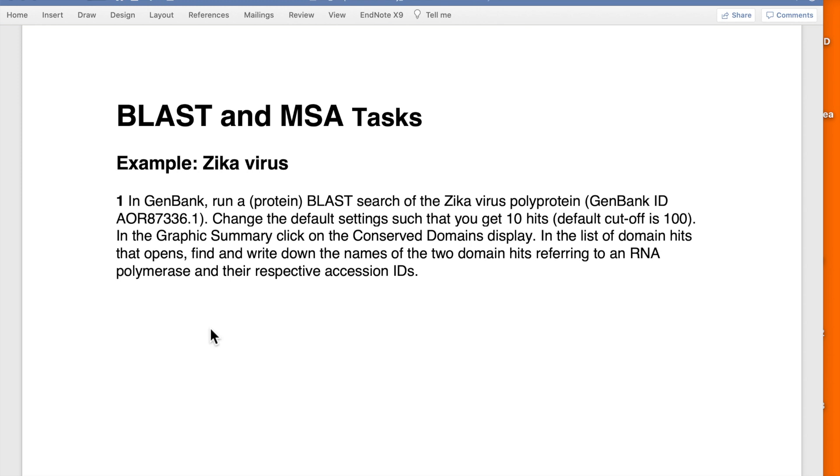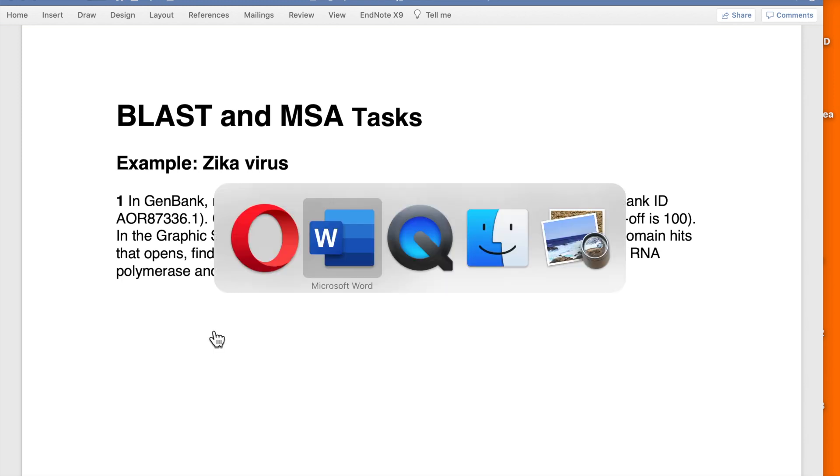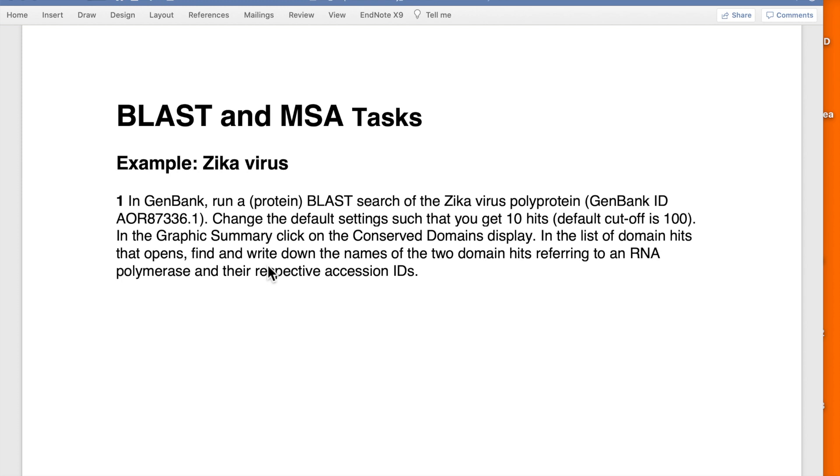Exercise one: In GenBank, run a protein BLAST search of the Zika virus polyprotein with the given ID. Change the default settings such that you get 10 hits rather than the default which is 100. Before we go any further and see what to do with the results, we might just as well set it up like this.